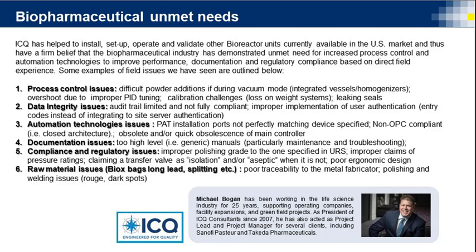More details of issues that we've seen related to data integrity: user management access controls that may not be configurable. All users may have admin privileges, or certain users have access rights to roles that are not required. Data backup functionality may not exist or may not be configurable to be performed per a defined schedule. Audit trail functionality may not exist, or it may be possible to inactivate the audit trail. Data deletion may be possible within the software or through the Windows side of the system.